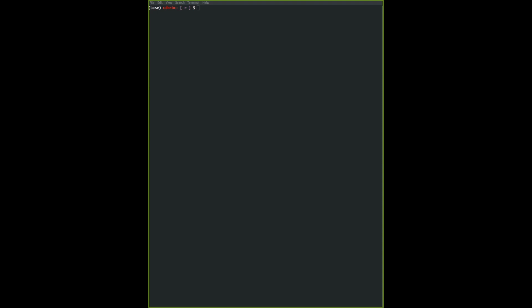So everything is logged because we're not going to use a script today. We're going to directly input commands into the terminal. And also in the coming few days, I will send you the code that I've written today with a little bit of illustration, a bit of notes so that you can benefit from what I have to say during the workshop.